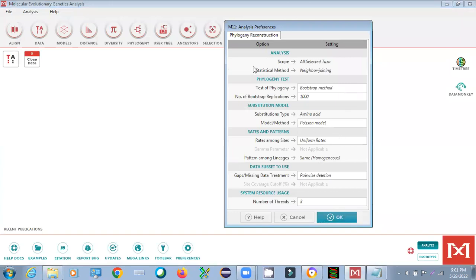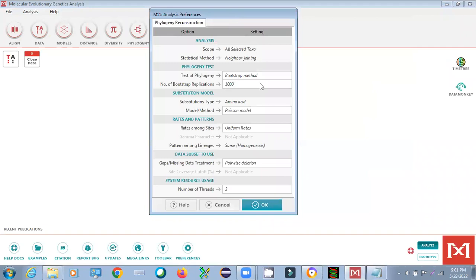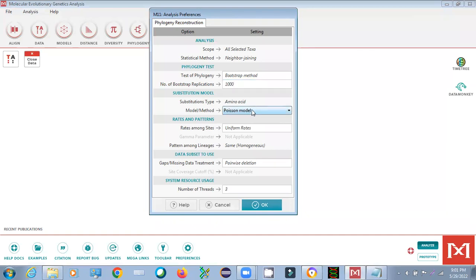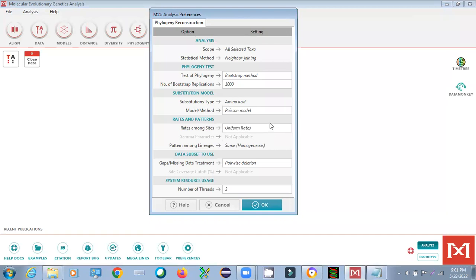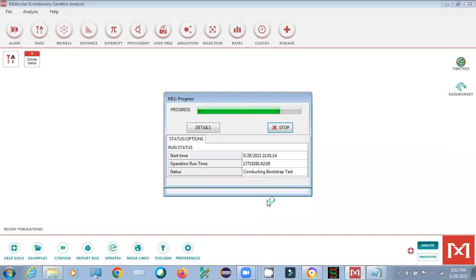Your data will open in the analysis window. Now set the parameters. For the bootstrap method, set the bootstrap value — for publication purposes, we generally use 1000 bootstrap replicates. You can change this value here. For the substitution model, we generally use the Poisson model. Keep other settings as default and press OK to run. You will see the phylogenetic tree being generated.